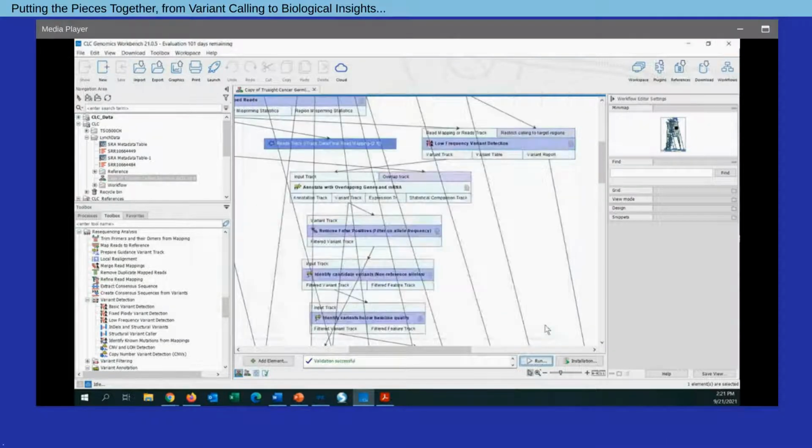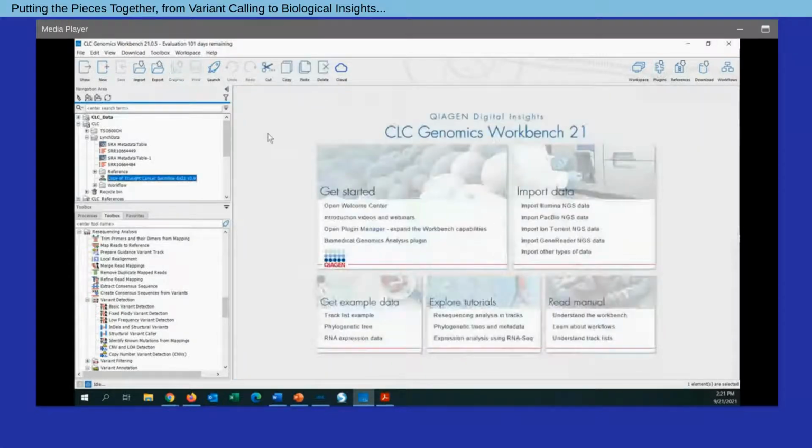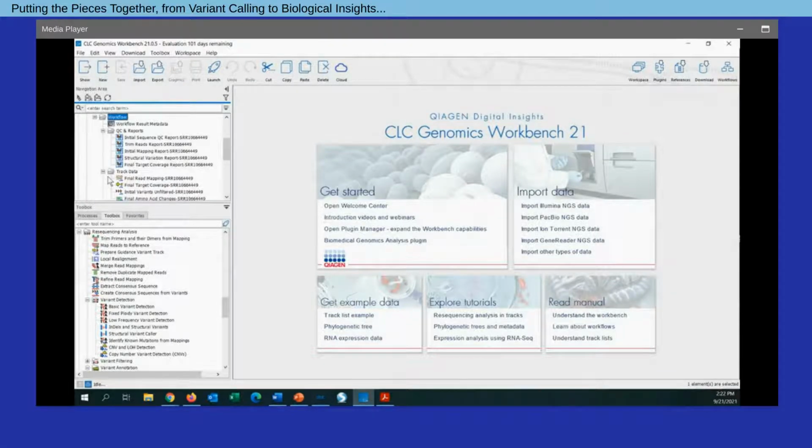So at this point, I've gone ahead and run the workflow in advance just for time purposes. And let's take a look at some of the outputs. So in my navigation area here, I've designated a folder for the outputs of the analysis. You'll see there is a subfolder here capturing different QC reports. So in particular, in this scenario, I might have a general QC of my FASTQ sequence, information with regards to trimming and mapping and structural variant detection.